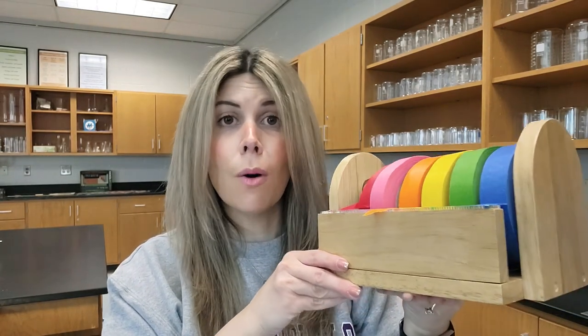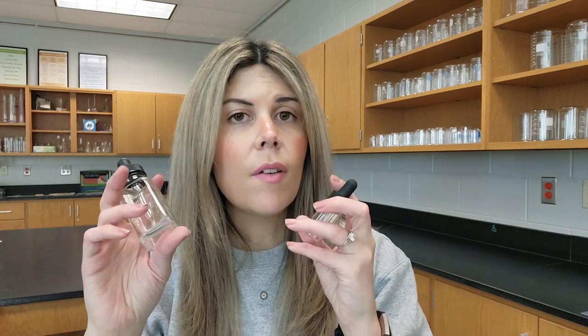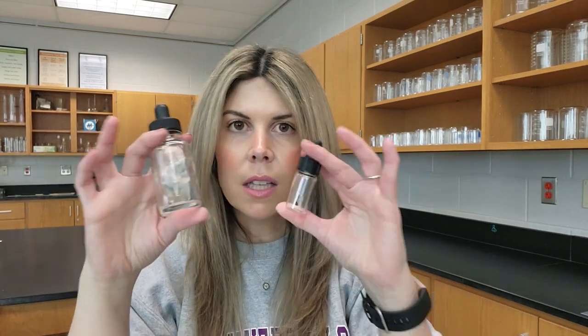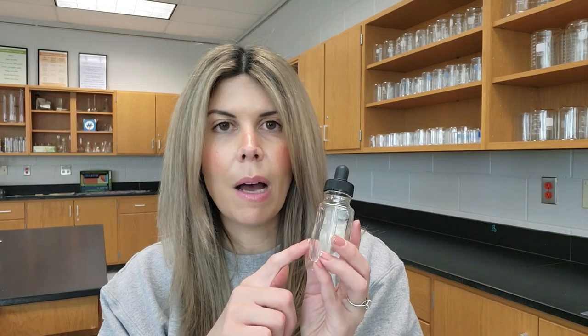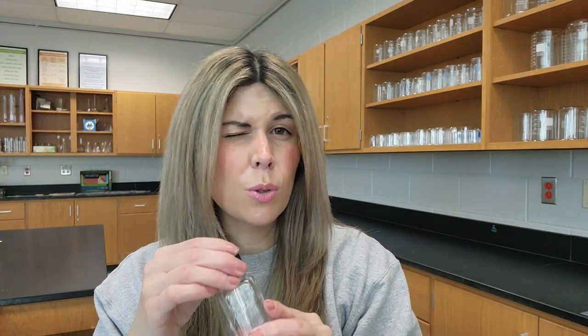Another thing you'll want to have on hand are reagent bottles. I have a lot of different sizes for making solutions, and then I transfer those solutions into dropper bottles. I always have extra dropper bottles on hand — small ones for things I'm adding dropwise, like indicators for a titration, and larger ones for things like a precipitation reaction on a smaller scale. I label them with masking tape, which just keeps everything easy and organized. One thing to watch out for: if you store acids like hydrochloric acid in these bottles, dump them out at the end of the school year because the acid will corrode the rubber and ruin the bottle. Pour them out and start fresh next year.